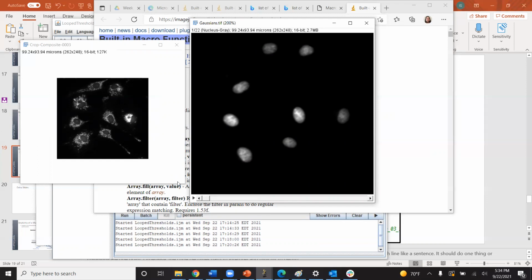I know I've tried to do this by hand previously, and it's relatively tedious and difficult to process a single image and then save it, and then process a different one and then save it, so that I could have a bunch of ones to compare the results with. So definitely, I think this is easier and much more versatile. So does anyone have questions about how we got here?